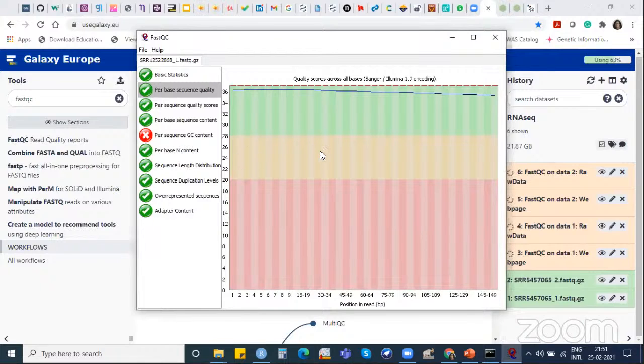If yellow, and you cannot generate more data or rerun the sample, you can work for some objectives, but not always. But if your Q score falls to 20 or below, then your data is not good to go for further downstream data analysis.